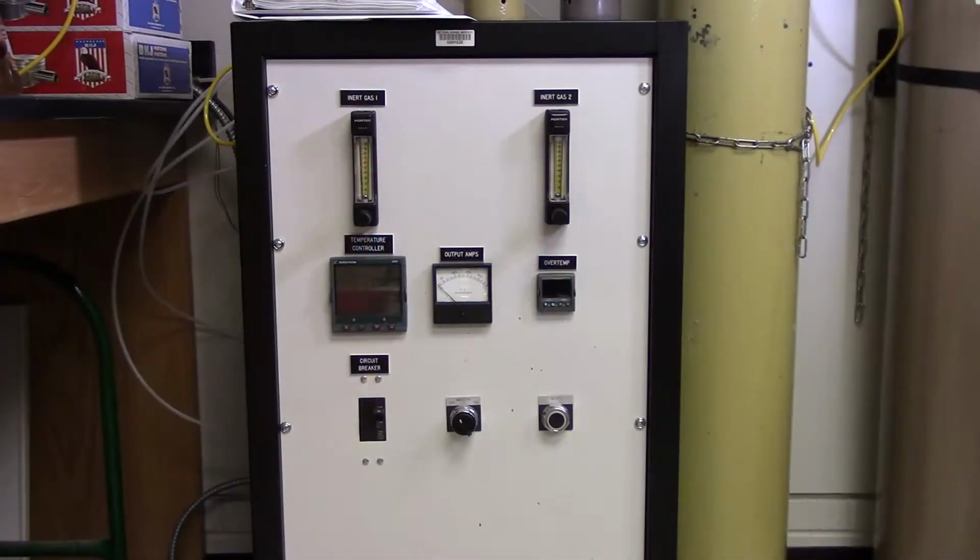So today, we're going to be doing a standard annealing of low-carbon steel. In order to do this, we need to program the furnace to heat up to 930 Celsius in an hour, keep it there for 3 hours, step it down to room temperature, and let it cool for 5 hours.